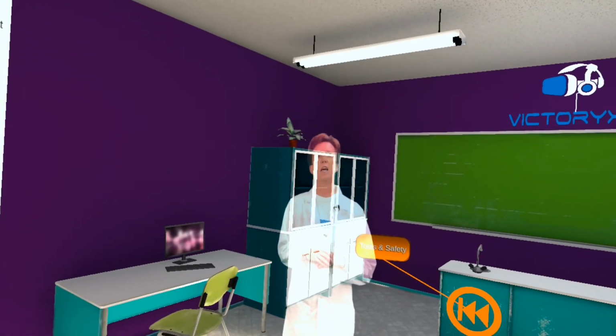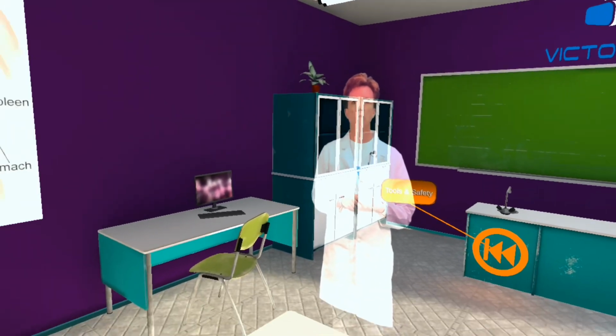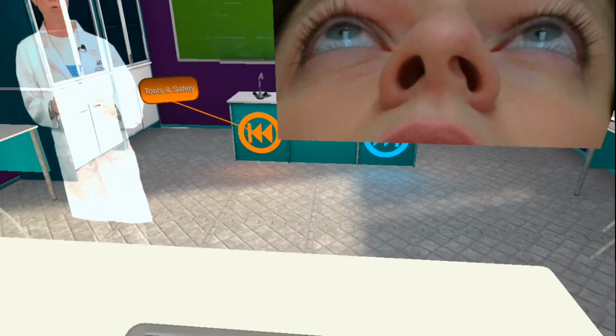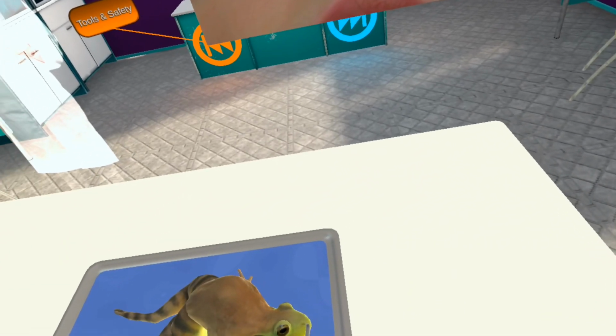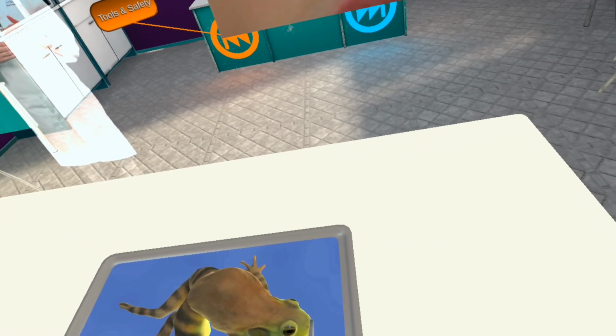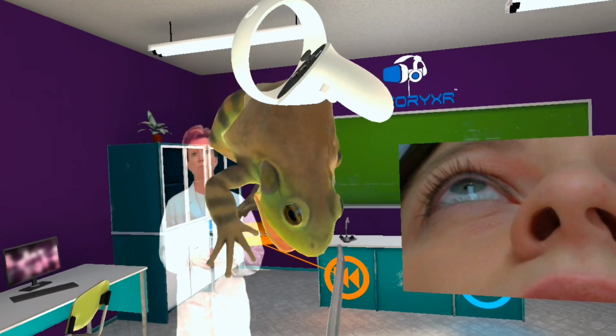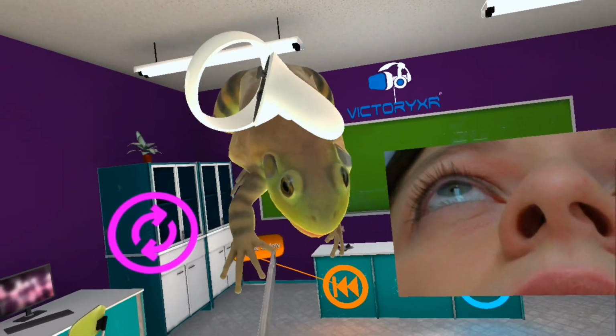Now go ahead and touch the external nares with the probe. The structure is similar to your nostrils. The external nares allow for entry and exit of the air. Their nostrils are located on the top of their head to allow breathing while most of the head is submerged. I thought that was the nostril. Is that not the nostril?